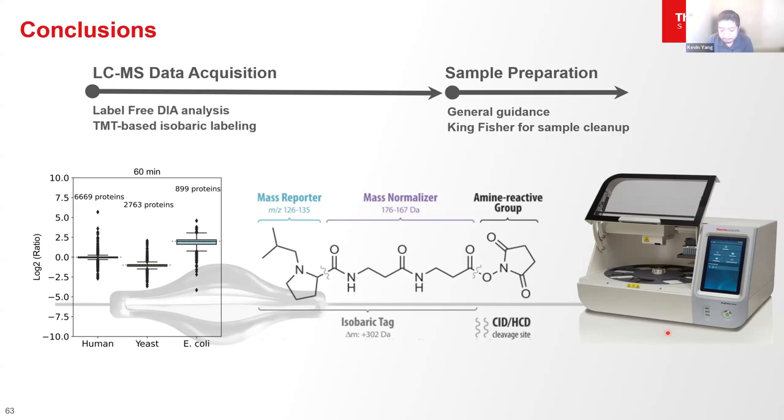But what I found is there's minimal overlap between the results you get from Olink and mass spec-based proteomics. In other words, to us, these two approaches are sort of complementary. If you put these two together, that will improve your coverage even better, right?